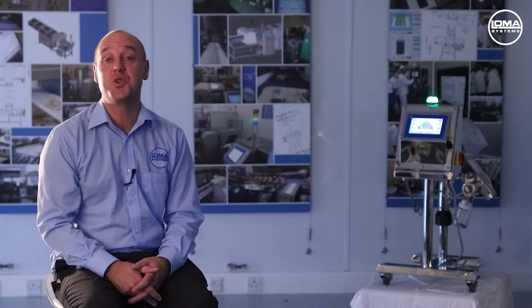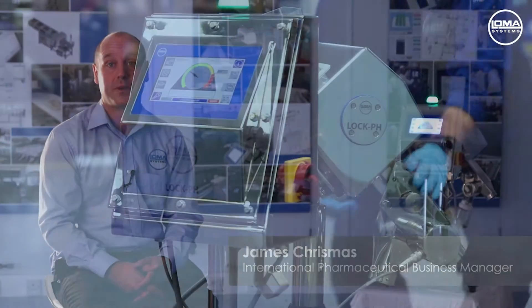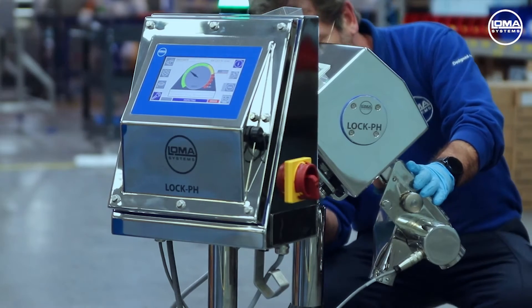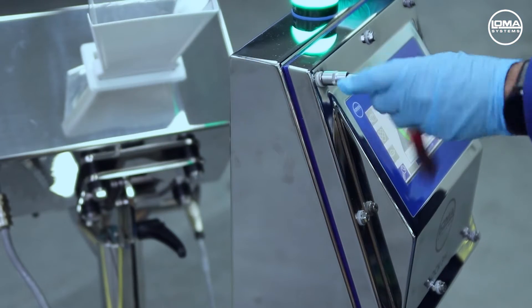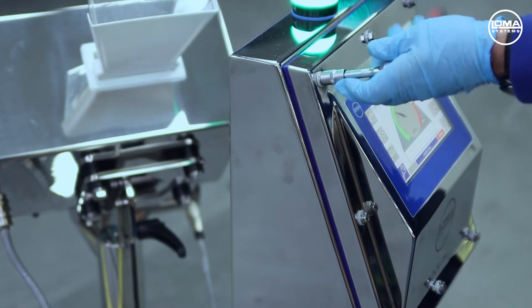Welcome to the introduction of the new next-generation solid-dose pharmaceutical metal detector, the LOCPH IQ4. This is a culmination of LOC's understanding and knowledge of the pharmaceutical industry combined with LOMA's robust manufacturing techniques.